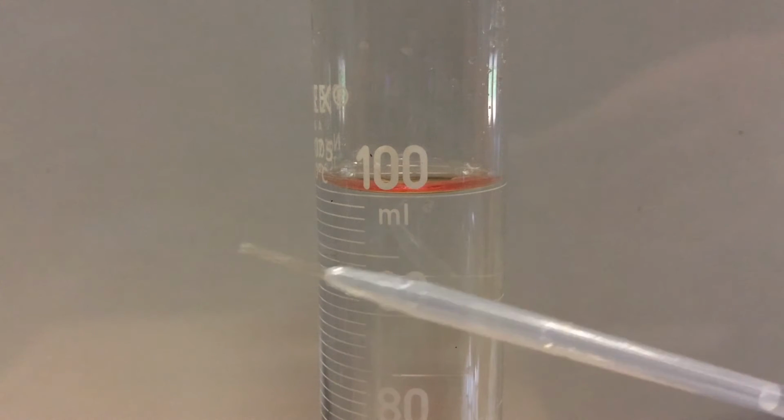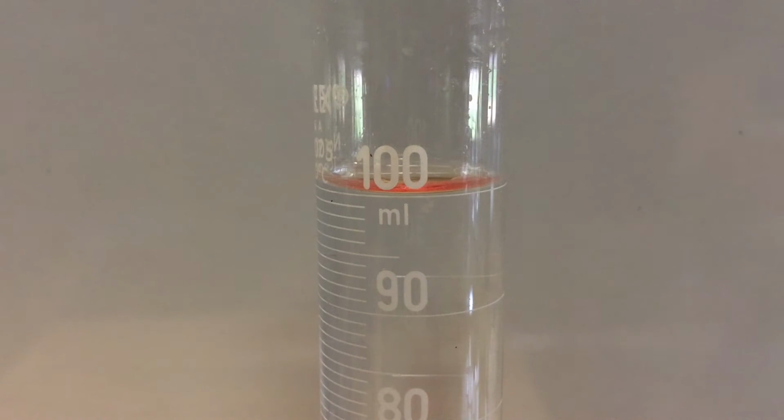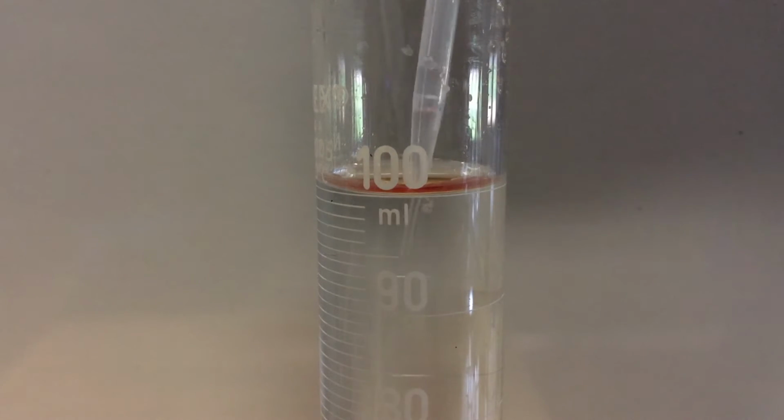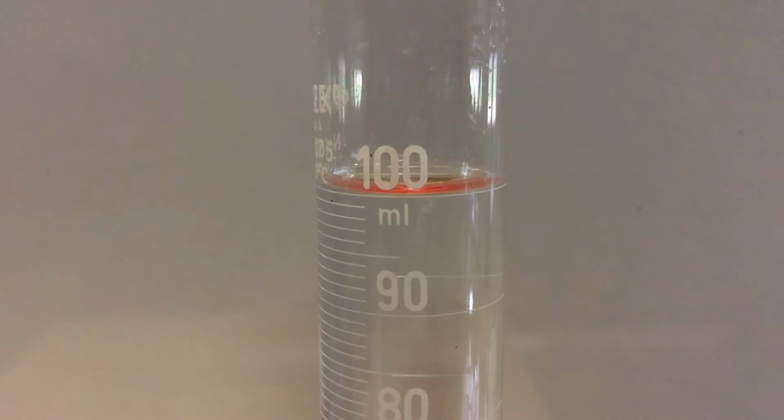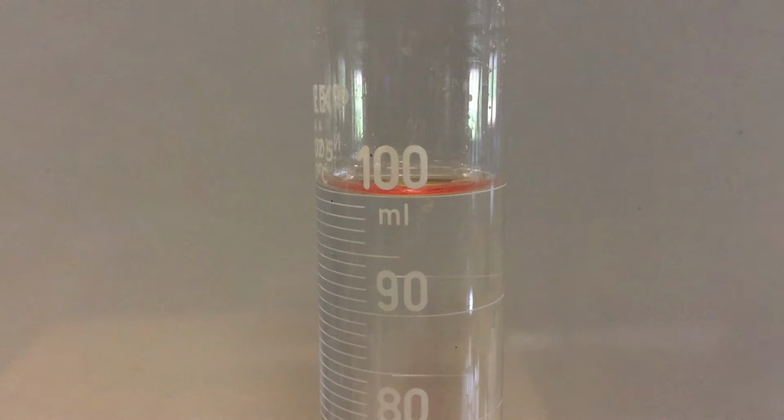It's very subtle, but there's a curve here, and we're going to read the bottom of the meniscus, and we're trying to get that bottom just a touch to 100. So I'm going to grab just a little bit more and see if that makes any difference. Again, it is a big difference in lab, but I think right there does it. So we're on the bottom of that meniscus, and now we have 100 milliliters.